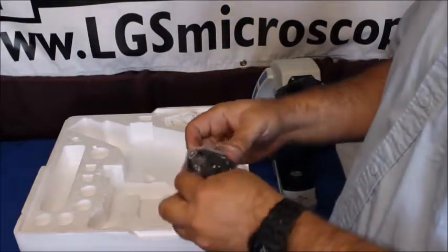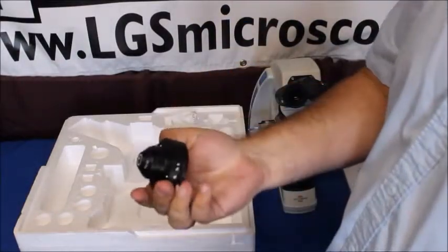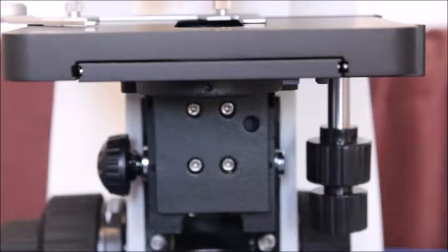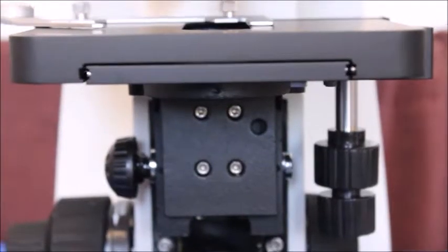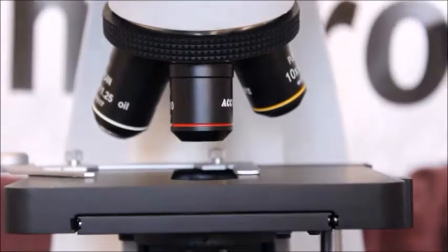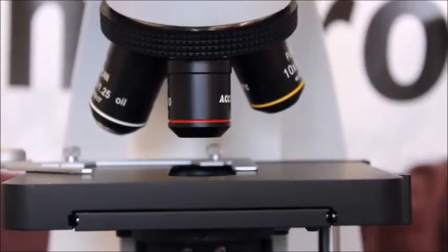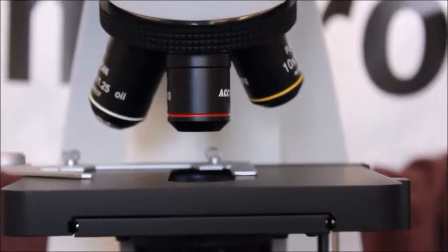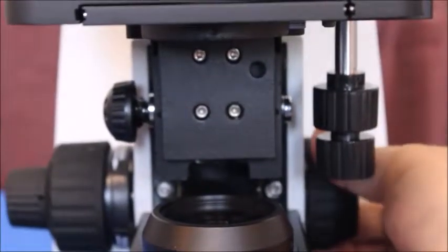So I'll show you how to install this condenser here. Okay, now we're going to install the condenser. So first you want to make sure that your objectives, you're on the 4x objective because it's the farthest away from the stage. We want to raise the stage all the way up using the coarse focus over here or on the other side.